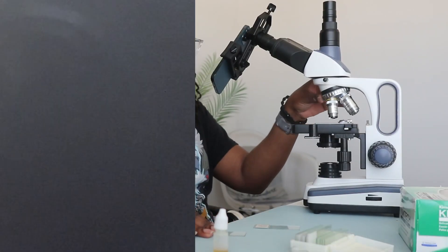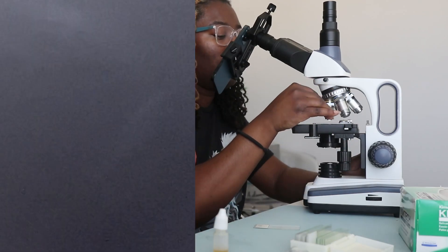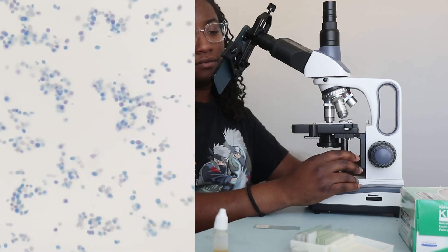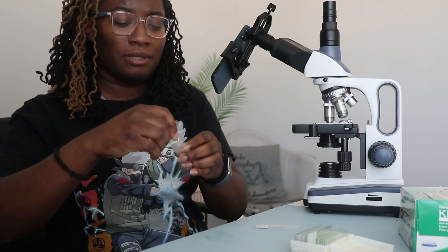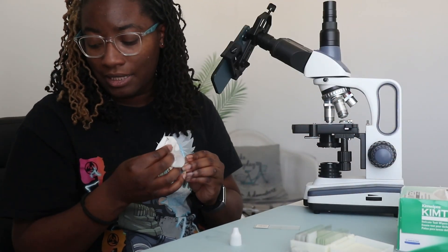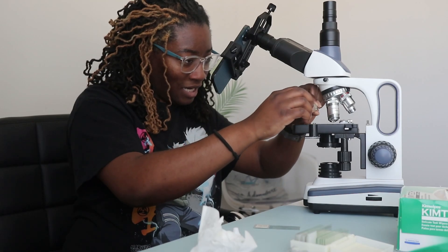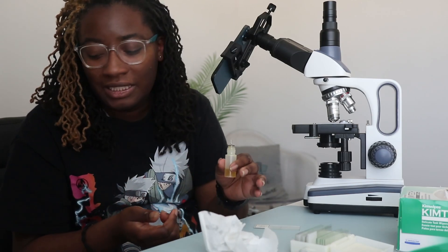The next thing we're going to look at is yeast. This is 4x, which you won't be able to see anything because they're microscopic. Then we go to 10x. This is 40x. We are going to use this mystery oil that I found in the container, but it kind of exploded on me when I tried to open it. I don't know why they would put something in there that's not labeled, but I don't see what else I would use it for besides my 100x lens. The topper does not work — there's not a good seal on it and I need something to get the oil off.